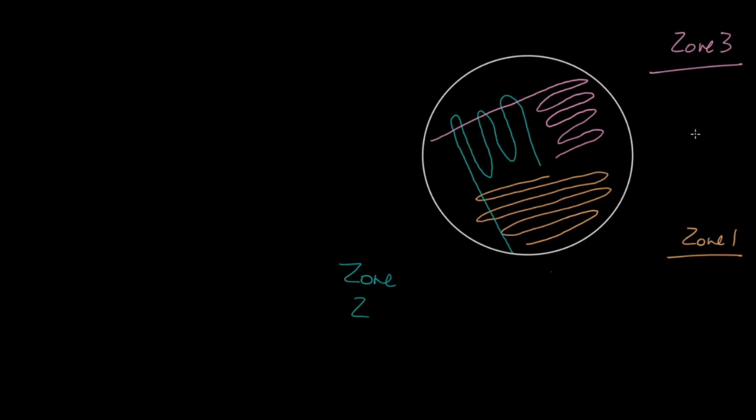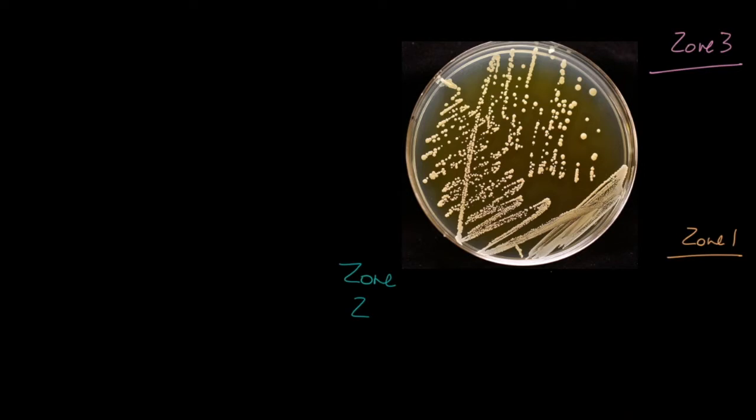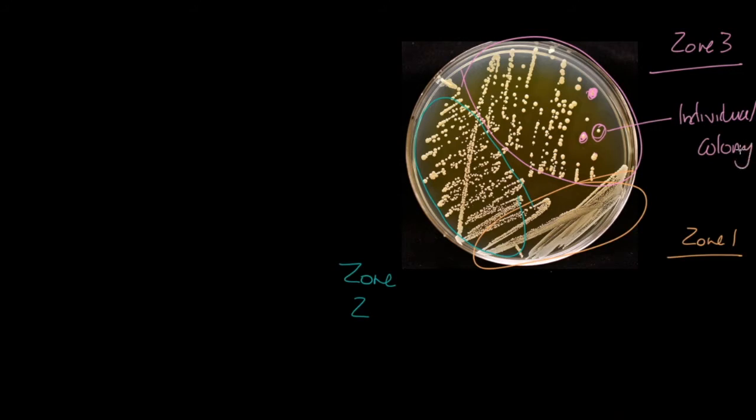We normally rotate the plate rather than repositioning ourselves. With zone three, we pass through zone two and streak across that area. The idea is that zone three has fewer bacteria than zone two, and zone two has fewer than zone one. In zone three we aim to get isolated individual bacteria — one individual bacterium — which can grow into a colony. After incubation we would expect to see individual colonies clearly separated in zone three.